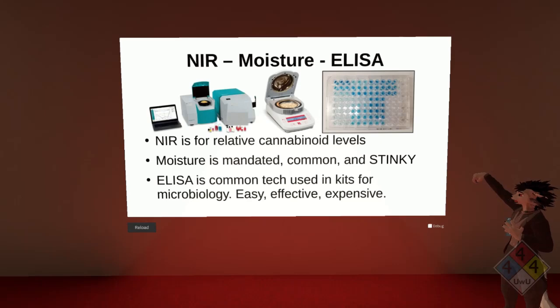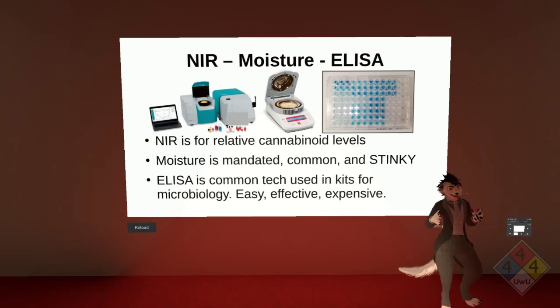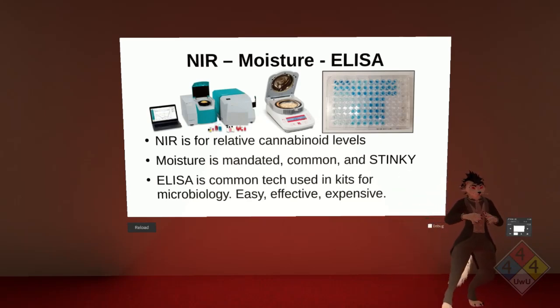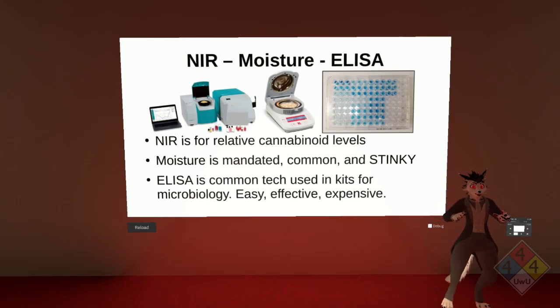And ELISA is definitely worth talking about. Enzyme-linked immunosorbent assay. This basically uses a plate with antibodies bound to the bottom of a well plate, and you pipette reagents in using a specific set of instructions. It gives you a pretty reasonable, quantifiably accurate result. The equipment used to quantify it is a UV detector, so it's very basic spectroscopy. Again, a very fancy flashlight, and this is definitely a simpler version of one.